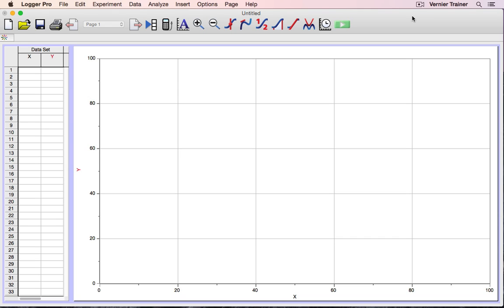Logger Pro is a great tool for collecting and analyzing data from Vernier sensors. Today, I'd like to show you some basic features of the Logger Pro software.